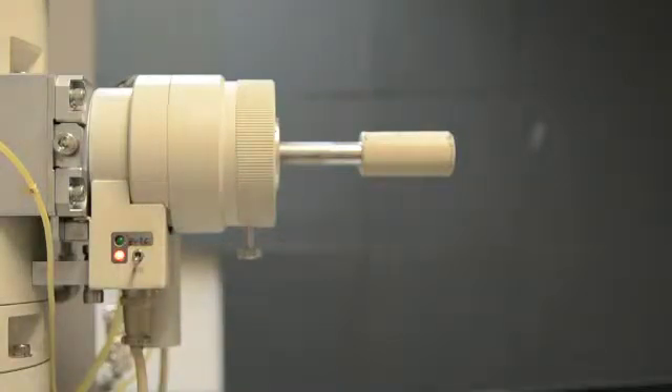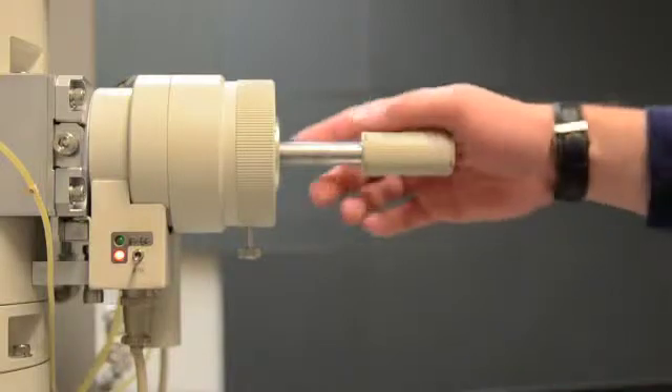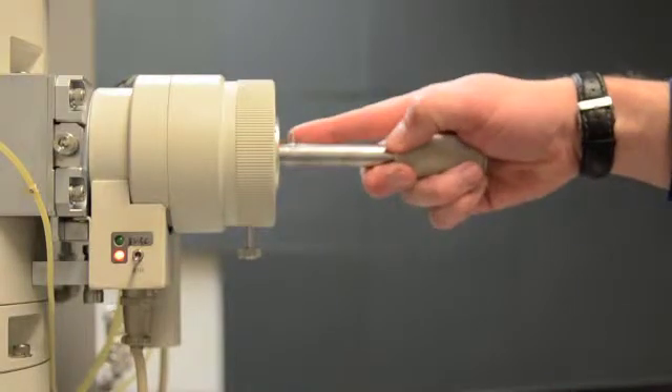Wait about 10 seconds and then gently pull the rod straight out from the stage, keeping your thumb or finger in contact with the outside.